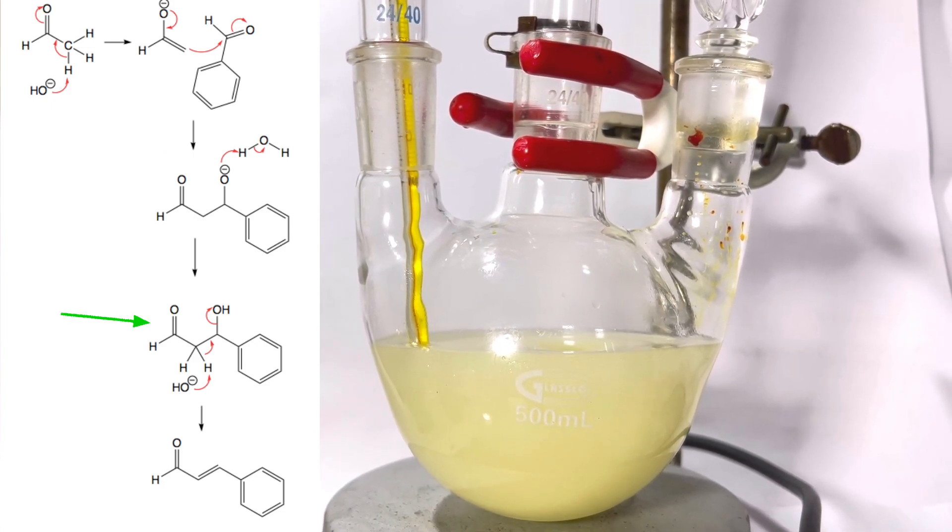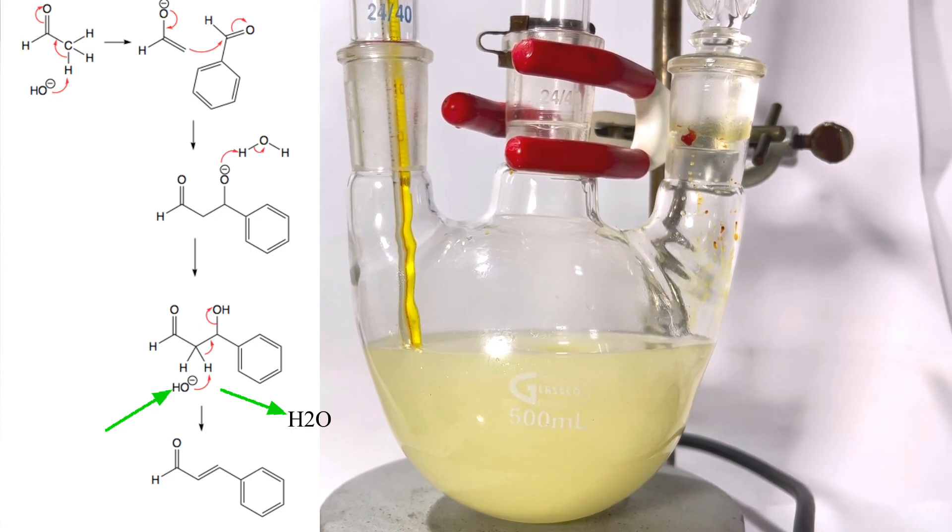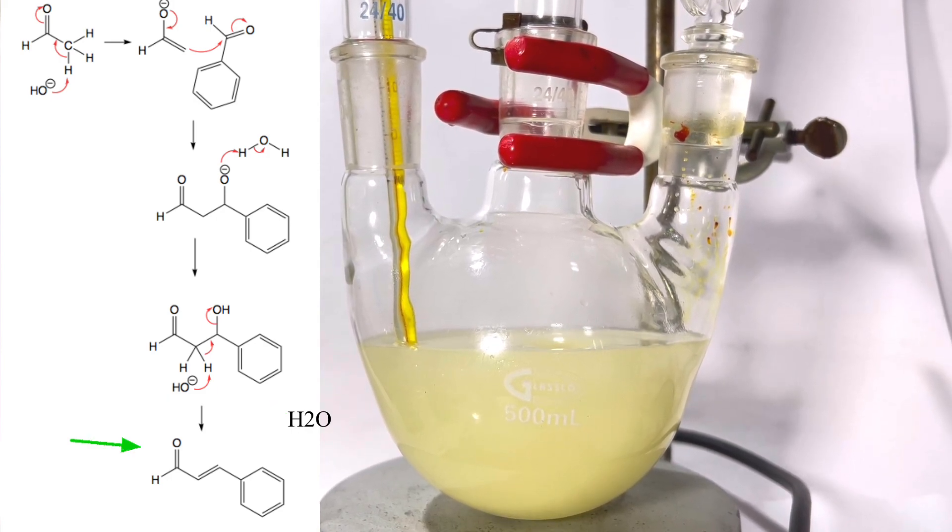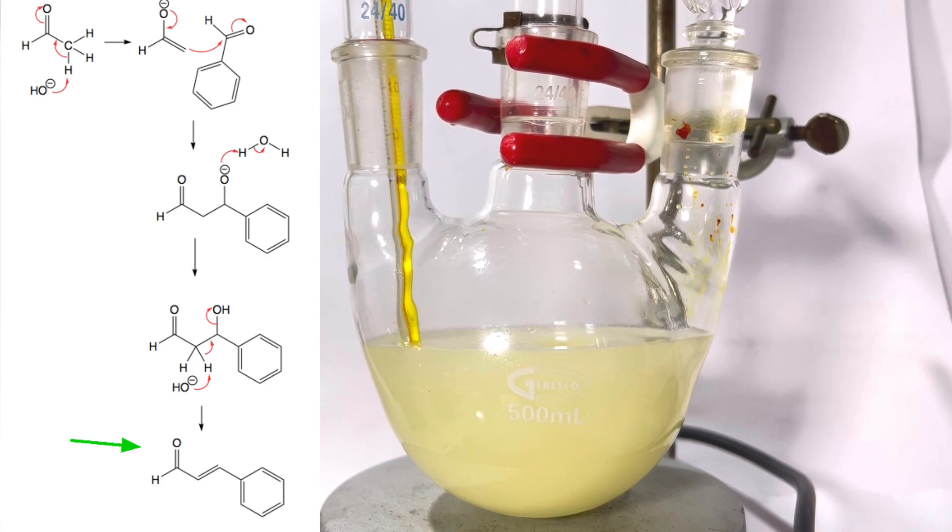The aldol then loses a molecule of water forming the alpha beta unsaturated carbonyl compound, which is the cinnamaldehyde in our case.